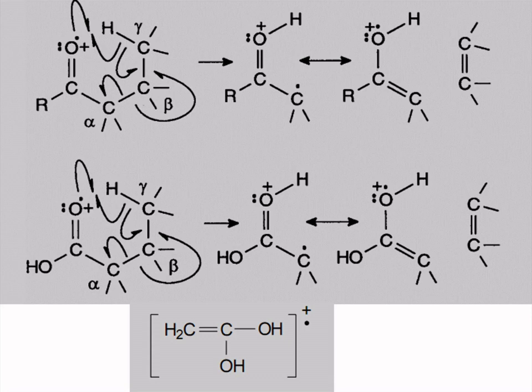In case of ketones, gamma hydrogen transfer occurs, and there is two-bond cleavage of the bond between carbon and hydrogen and the carbon-carbon bond, resulting in formation of an olefin and an odd electron ion, which is stabilized by resonance. In case of primary carboxylic acid, with alpha carbon not substituted by alkyl groups, we have a characteristic fragment ion at m/z 60.